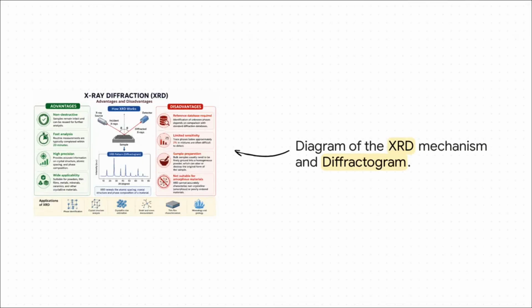And this whole setup beautifully illustrates exactly what we were just talking about. You've got the X-ray source firing those incident X-rays down at the sample. Notice that specific angle, theta. Then the X-rays bounce off, creating these diffracted X-rays that travel straight up to the detector. It is literally geometry in motion. As the machine continuously sweeps through different angles, moving both the source and the detector, it measures where the X-rays bounce strongly and where they just don't. That physical mechanism translates directly into the data output.